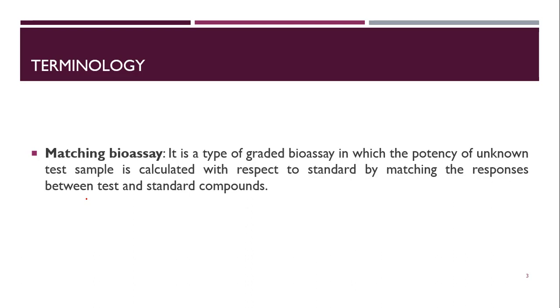It is very easy to determine, but this particular method suffers from certain shortcomings. These shortcomings we will be studying in further slides.